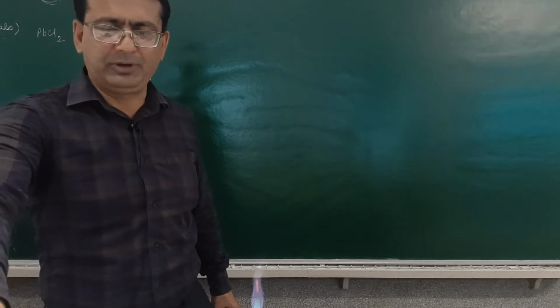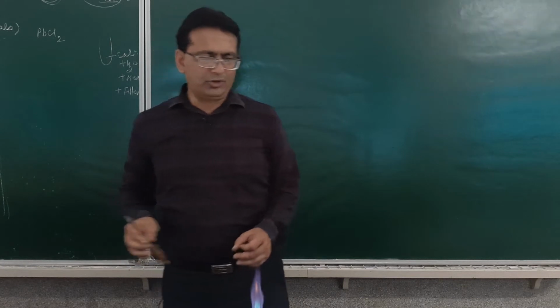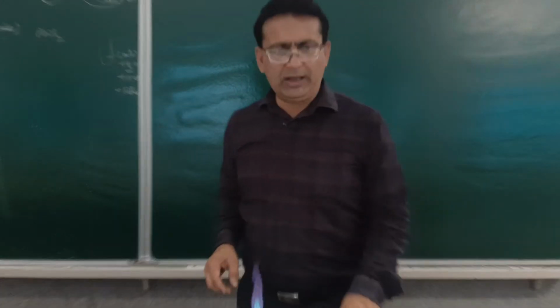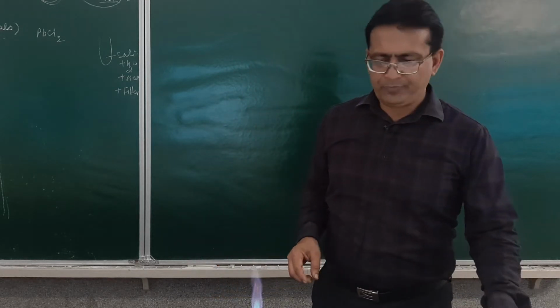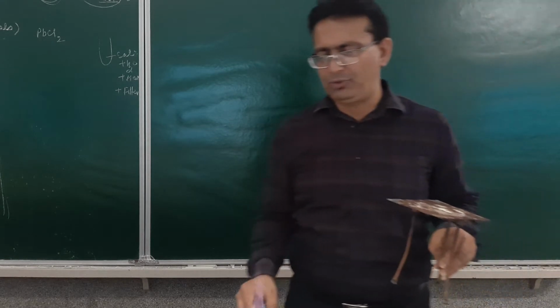First test on page number 2 is for the nitrate anion. You may see those tests. Is it clear? Now the second test for a nitrate ion is to be done by use of a sodium carbonate extract. How do we prepare the sodium carbonate extract?